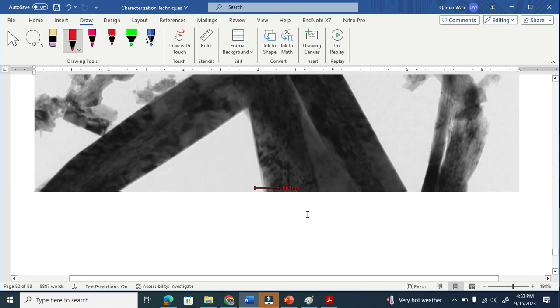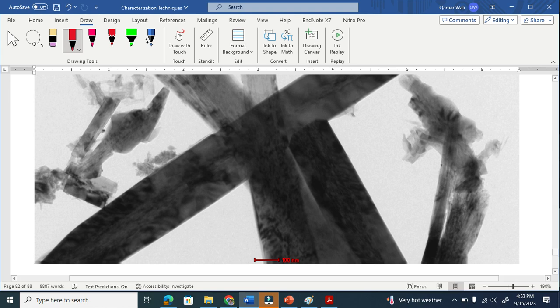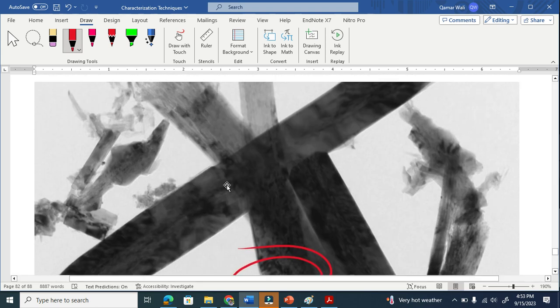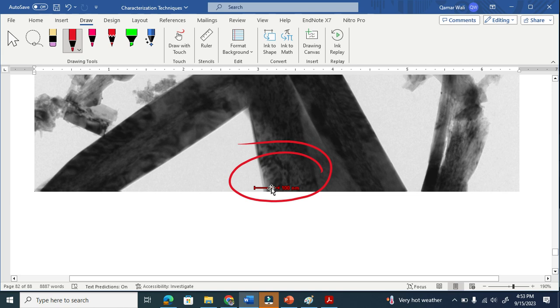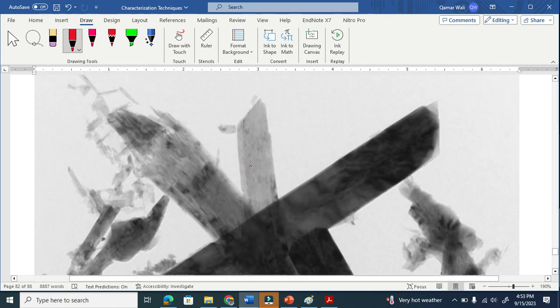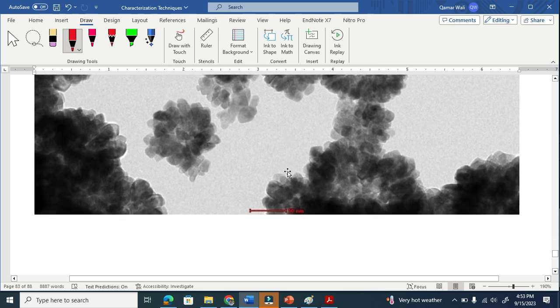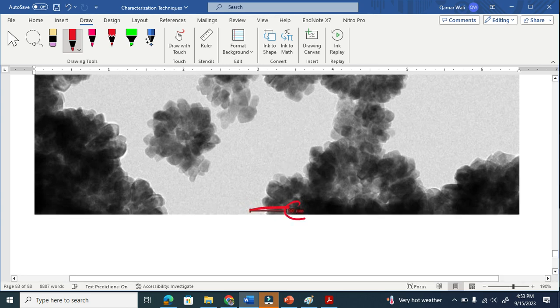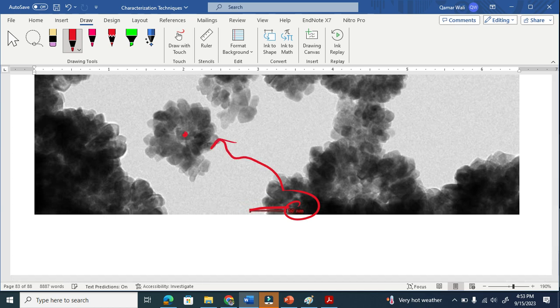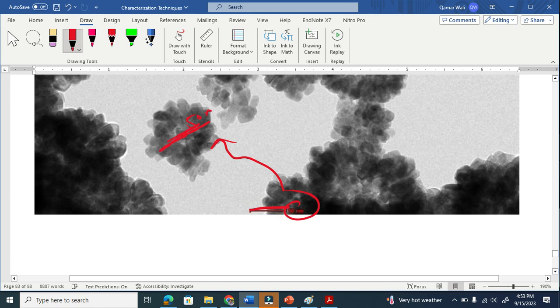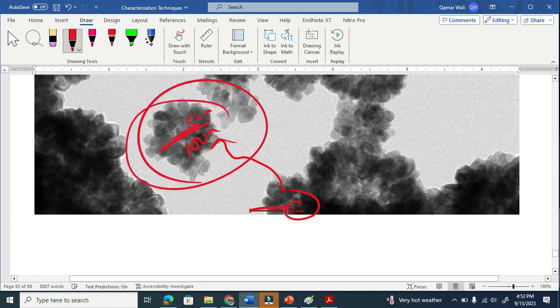In transmission electron microscopy, this is also at 100 nanometer scale. You can see something here that is closer to a nanorod — this is somehow 100 nanometers. This is another TEM image at 50 nanometer scale. This means the diameter is almost 50 nanometers, so the full diameter is 100 nanometers — this is also at nano scale.